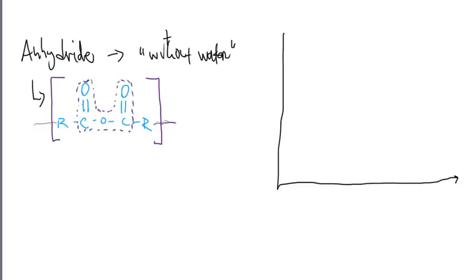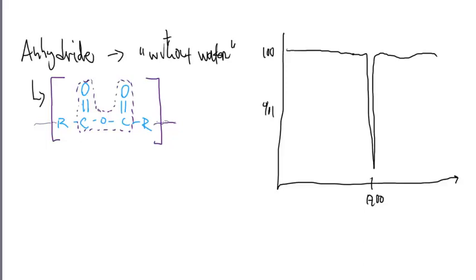we know that a carbonyl happens at 1700, right? This is something that we have talked about over and over in a previous video, or a slew of them, really. So we see a sharp spike that comes down and comes back up, and then it goes back down to the baseline, or 100% transmittance.